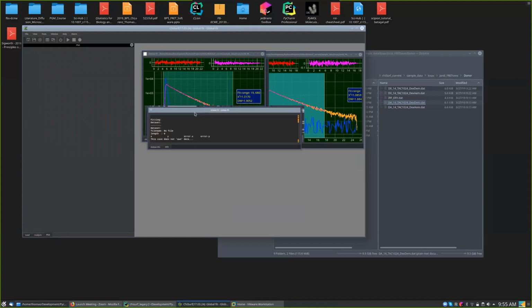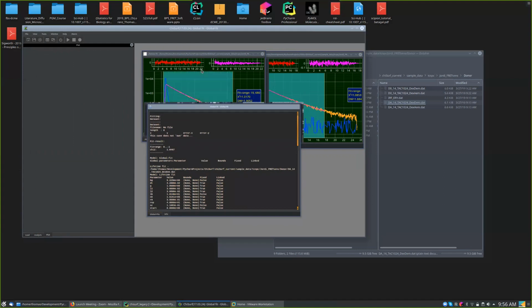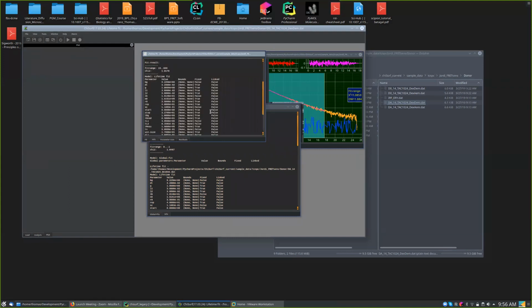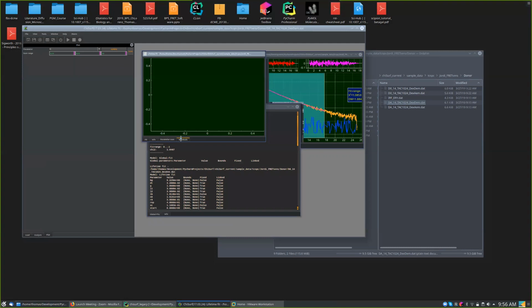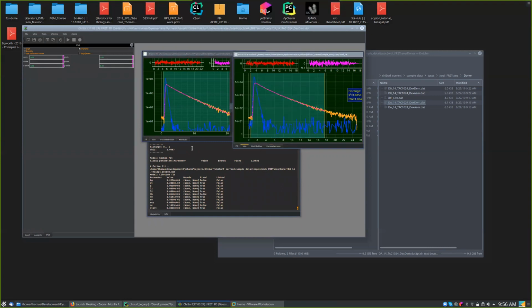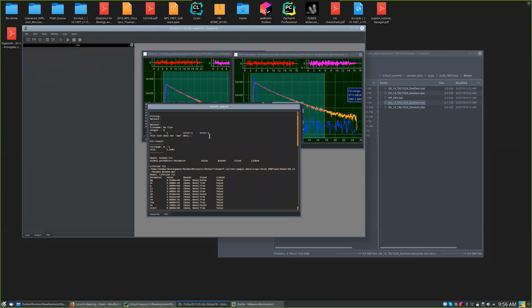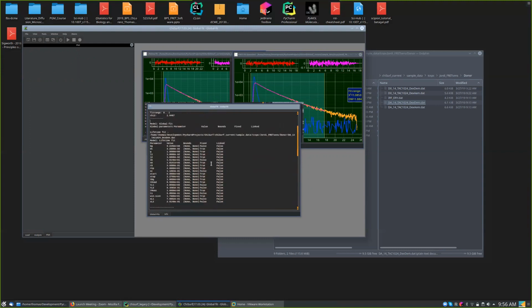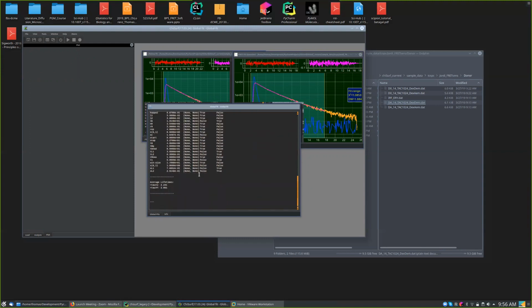And you see here in a global fit, in principle like in all fits, there is a representation for the data, an information representation that collects all the parameters and the respective values. And here, this is for estimating errors. You get a residual plot, and I think in newer versions you also get displayed all the residuals of the individual fits. So here you see a list of the different fits that are part of the global fit, with all their parameter names and all the values.